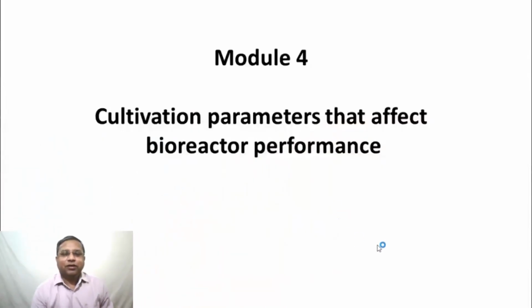Welcome to lecture 14 in the NPTEL online certification course on bioreactors. We will begin module 4 in this lecture. Title of module 4 is cultivation parameters that affect bioreactor performance.